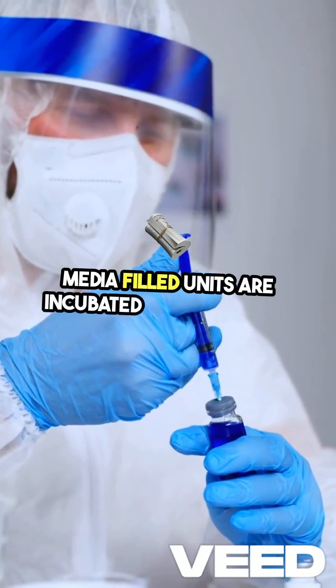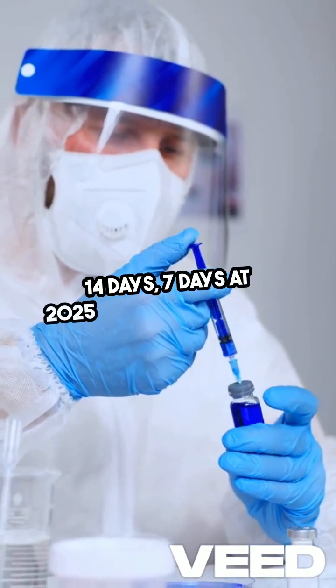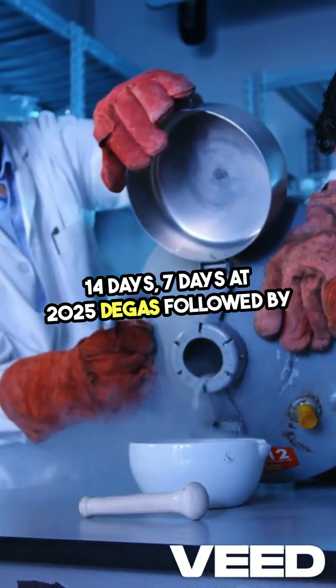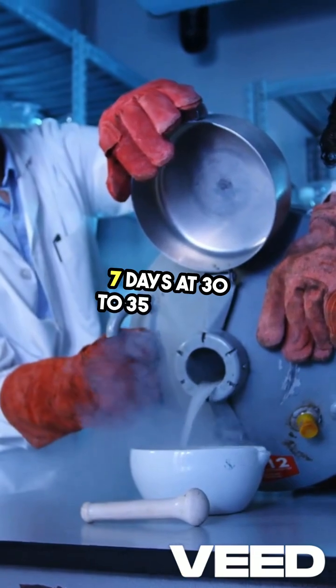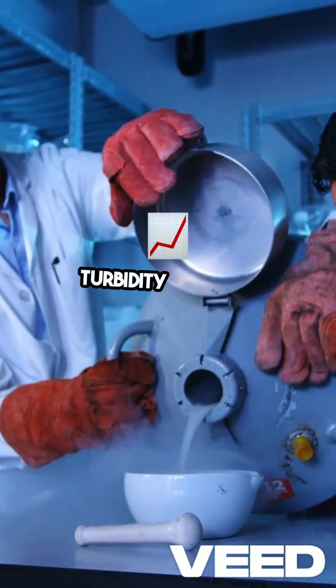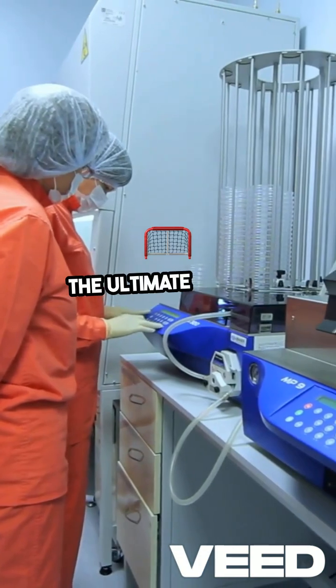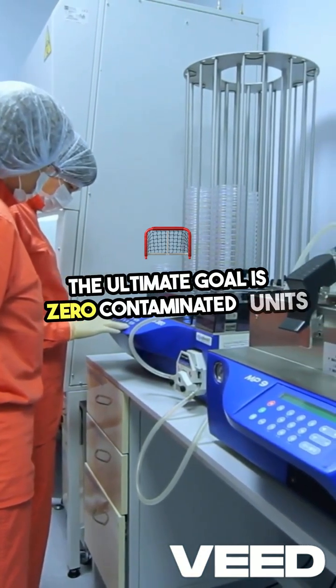Media-filled units are incubated for a total of 14 days, 7 days at 20 to 25 degrees, followed by 7 days at 30 to 35 degrees. Each unit is visually inspected for turbidity or signs of microbial growth. The ultimate goal is 0 contaminated units.